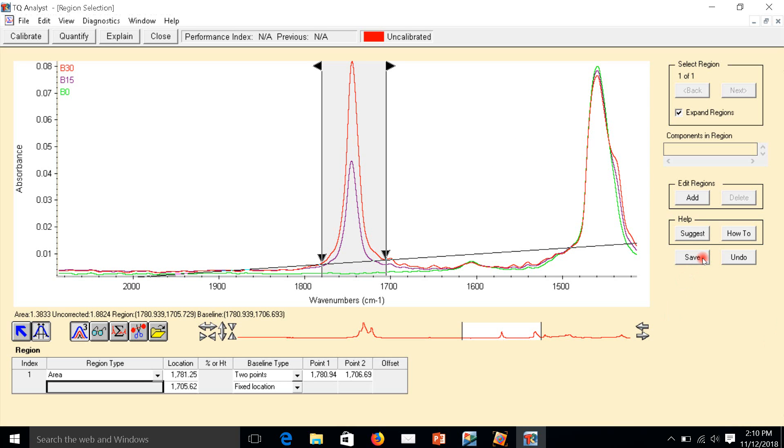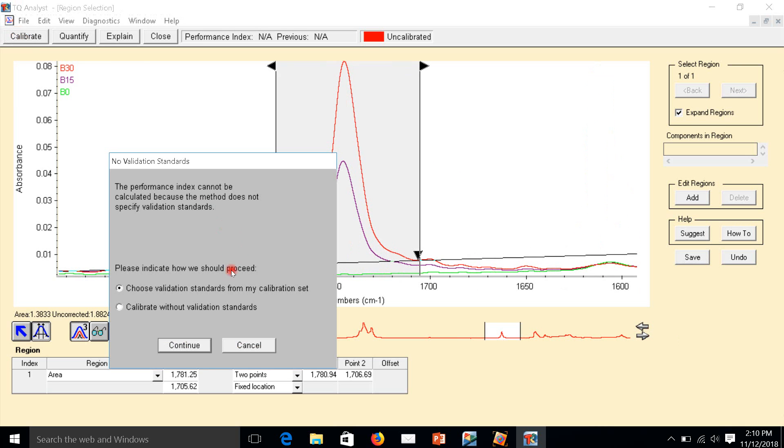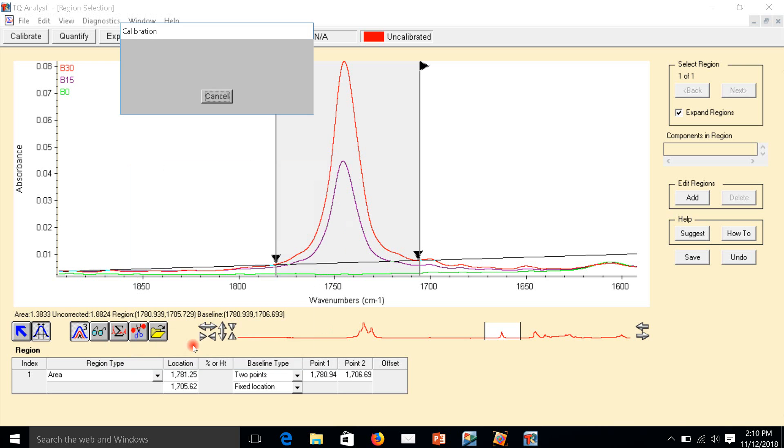After that, we have to select save and calibrate. Calibrate without validation standard. If you have validation standards, we choose the validation standard. For this moment, I don't have validation standard, so I just click without validation and click continue.